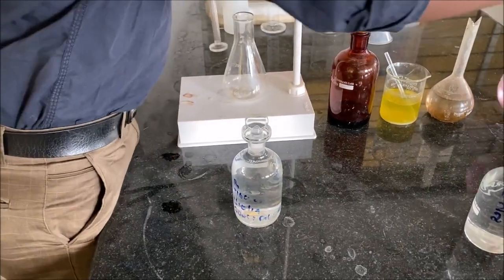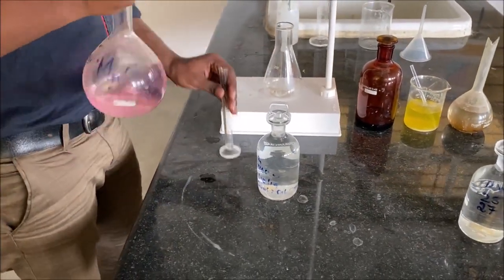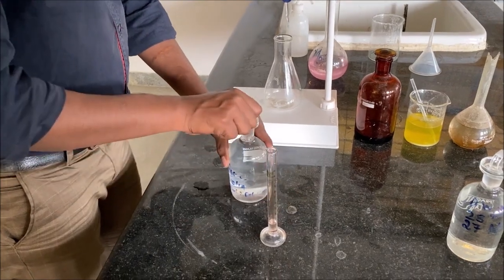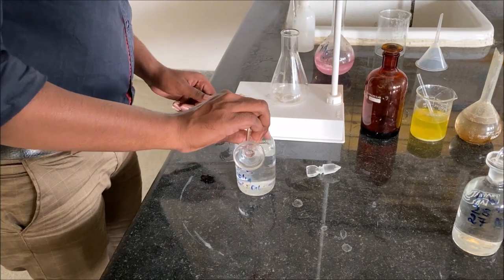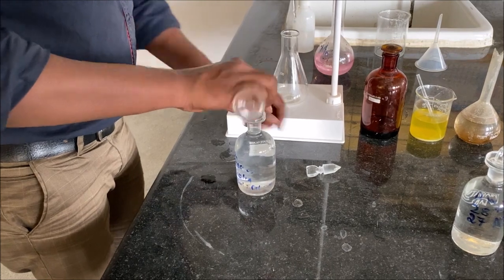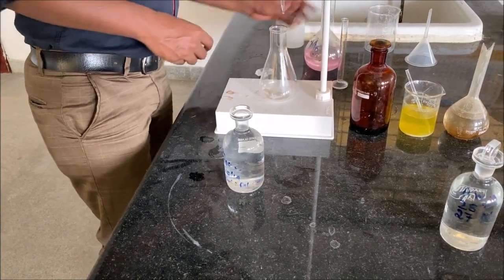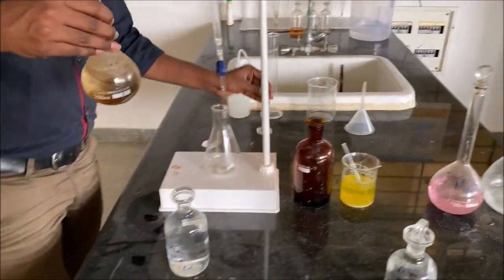Now, 2 ml of manganese sulfate solution is added, and then 2 ml of alkali iodide azide solution is added.